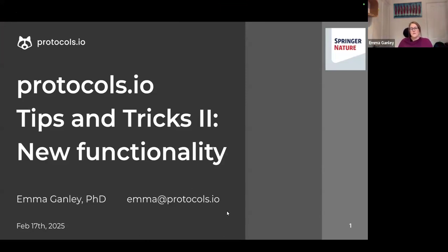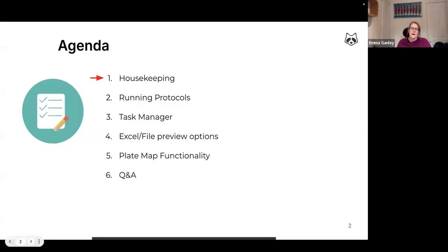So this is a tips and tricks webinar with slightly enhanced functionality. Perhaps you have been to an introduction webinar in the past. Perhaps you've been to one of our regular tips and tricks. I'm hoping that you have been to at least one of those so that you're already familiar. This is going to go through some of the functionality we built out in the last year, very much in response to feedback that we had from some of our customers. So I will get started.